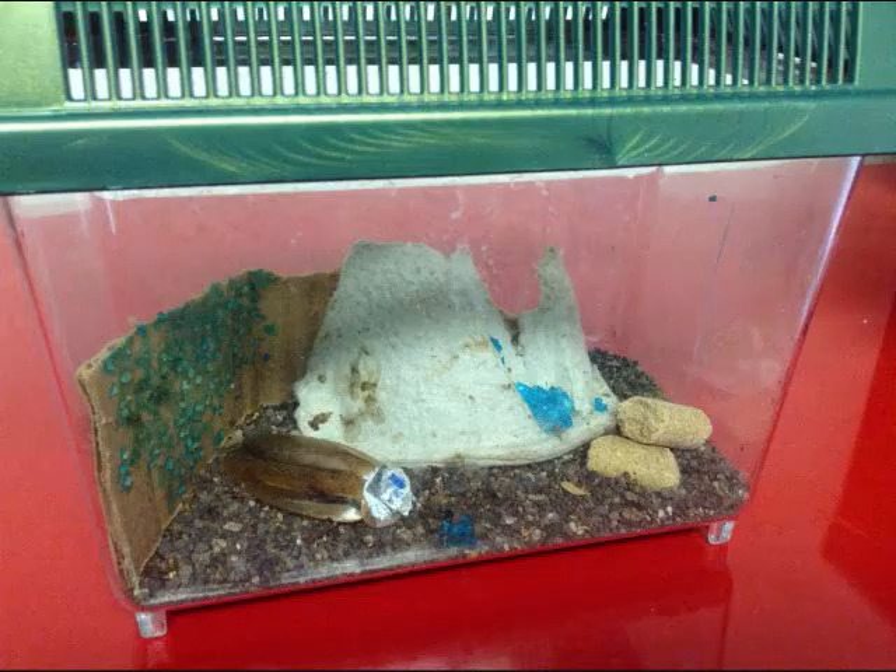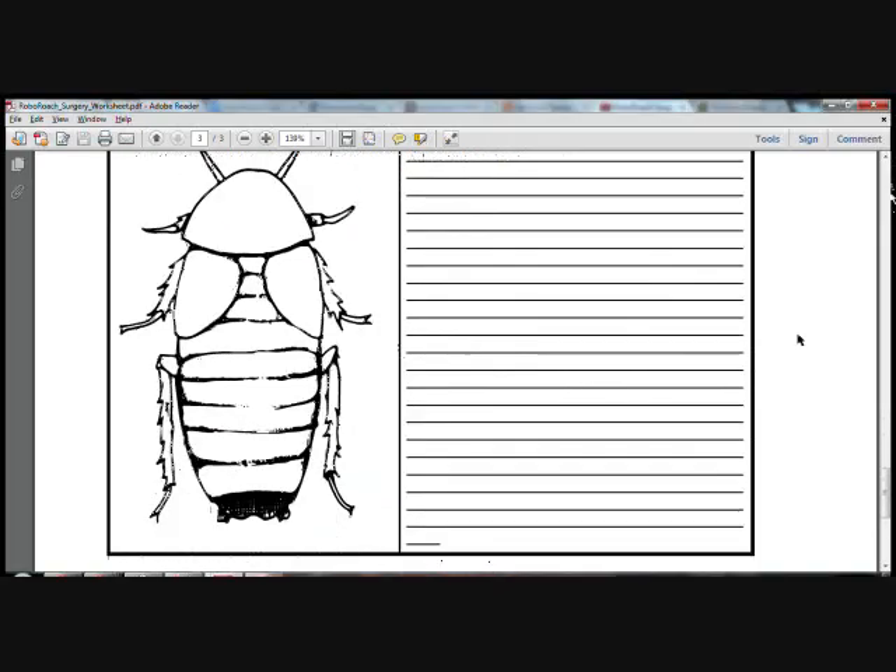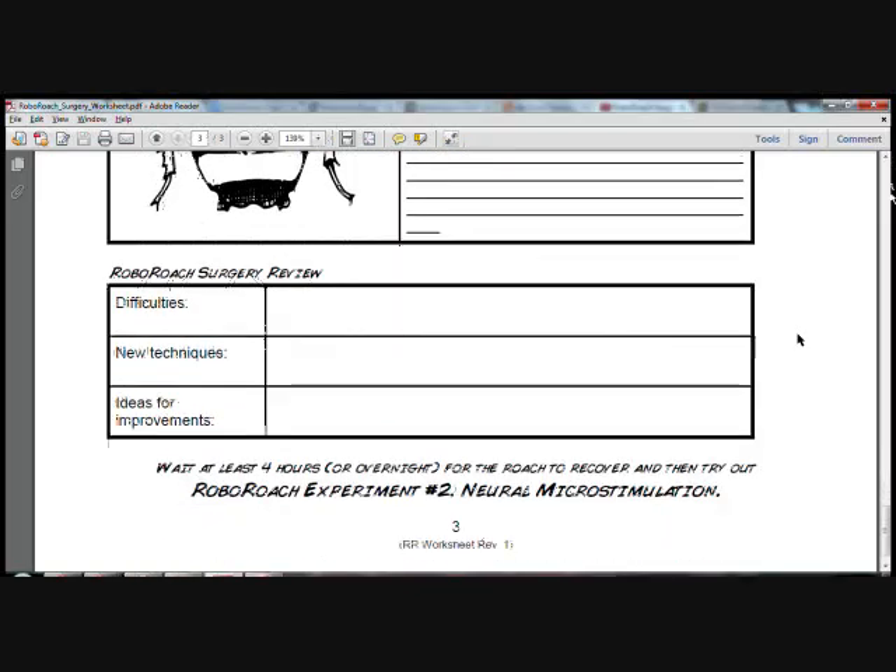Your roach should look something like this. Great job — you've made it through the RoboRoach surgery! Now it's time to clean up. Put the roach back in its terrarium and provide food and water. Recovery can take up to 2–4 hours. When preparing for demonstrations, we typically do the surgeries the night before to allow the cockroach a full night to recover — it will be ready for the experiment by the following morning. Put your tools away and discard soiled materials, clean your surgery table and tools, and always remember to wash your hands. Now take your time and complete the RoboRoach surgery worksheet by filling out the third page, the post-op review record.